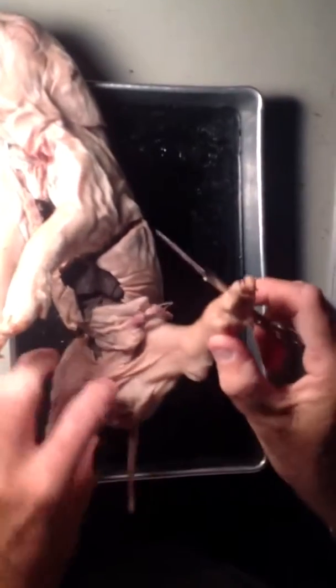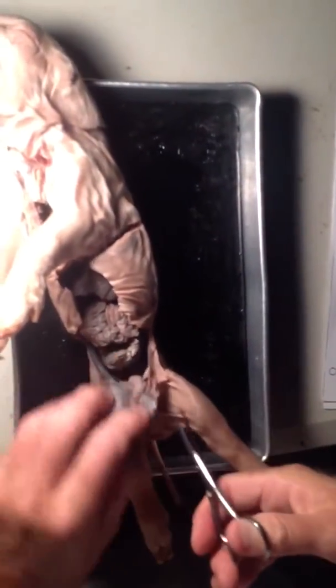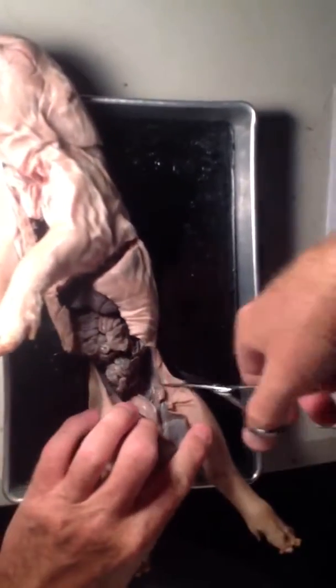This is a pig from fifth period. It's actually a decent size. I love the way these guys have already cut open the scrotum. That's nice. We need to finish their dissection.